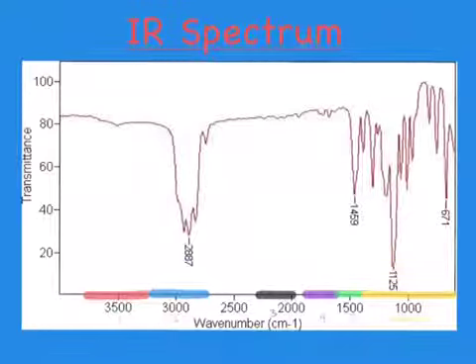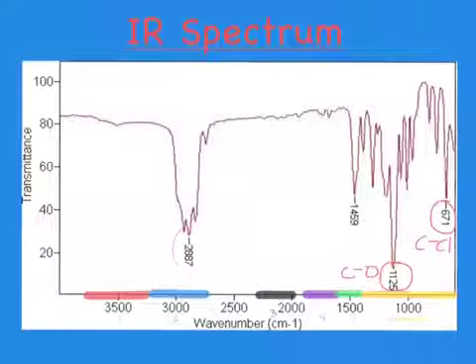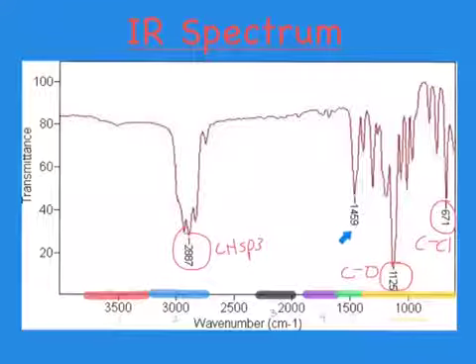The spectra is divided into 5 regions and a fingerprint region, with specific groups appearing in each zone. Each zone has been mapped out below. From the chart in the last slide, a peak located around 600 to 800 is a carbon-chlorine stretch. A carbon-oxygen stretch in an ether is around 1000 to 1300, and a carbon-hydrogen stretch that is sp3 hybridized is typically within 2800 to 3000. The frequency here resembles a bend, but I'm mainly focusing on stretches.